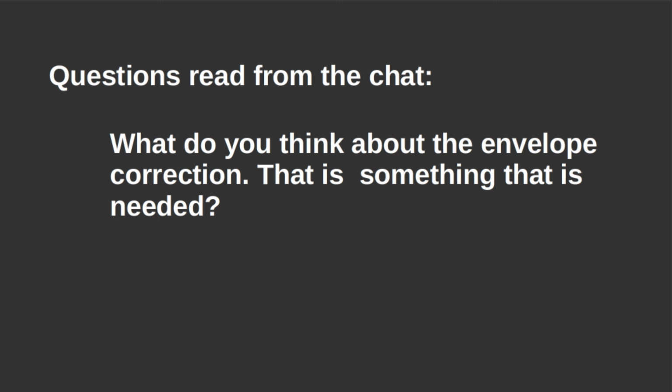This might be the easiest way to check if there is some improvement. I personally don't think you will gain that much, because all these things are sensitive to the estimation. For instance, we often use phase flip only because it's less sensitive to the estimation error. So it also depends on whether your data is good enough and you trust the estimation being precise enough, if it pays off to actually go for multiplication or for this envelope. It will be data dependent to test this.